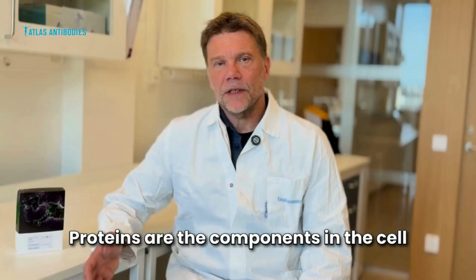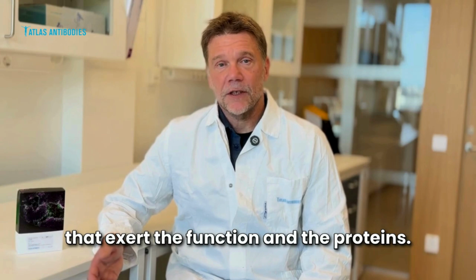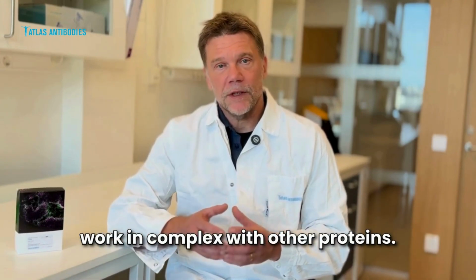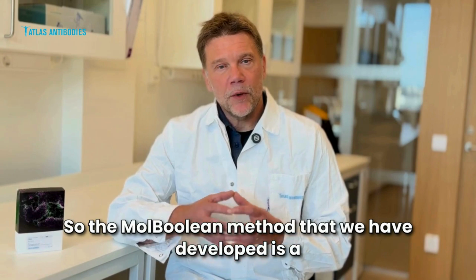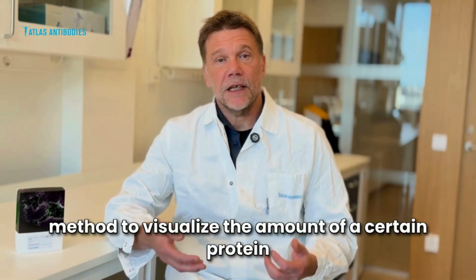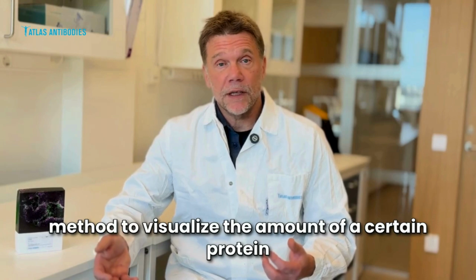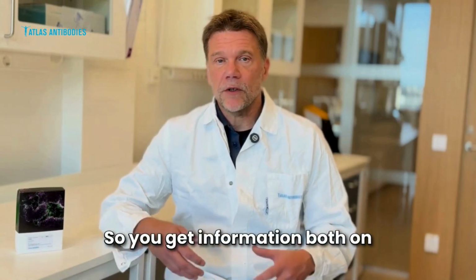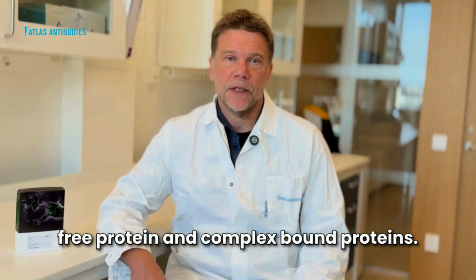Proteins are the component in the cell that exert the function. And the proteins, they work not by themselves, but they work in complex with other proteins. So the MolBoolean method that we developed is a method to visualize the amount of a certain protein and if it interacts with another protein. So you get information both on free protein and complex bound proteins.